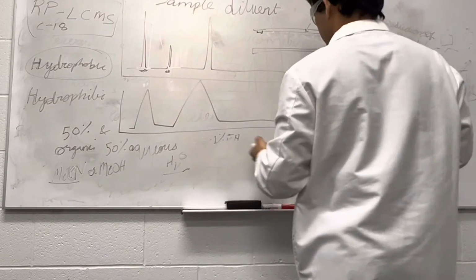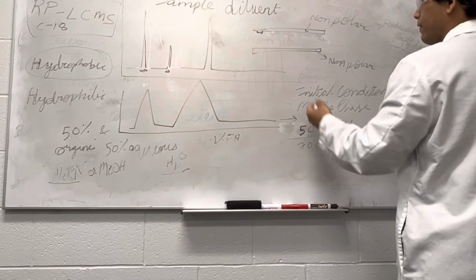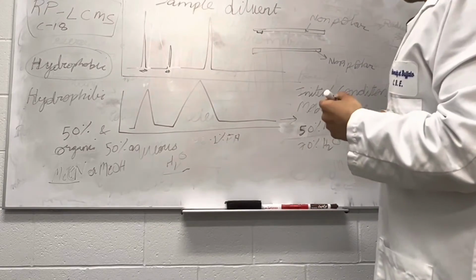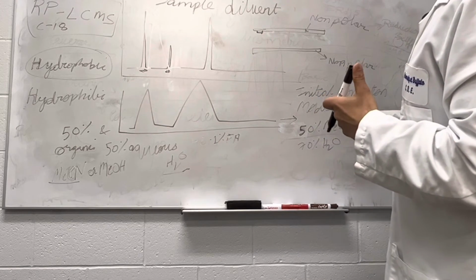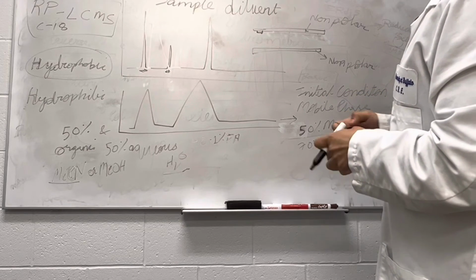And when the elution strength increases in the mobile phase, the analyte will come out at a specific time and we will see only a single peak.